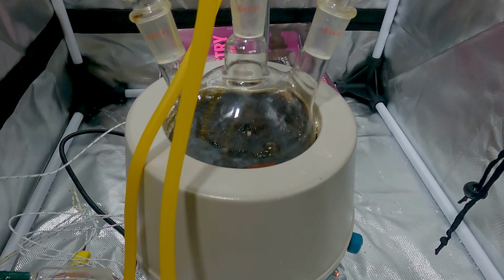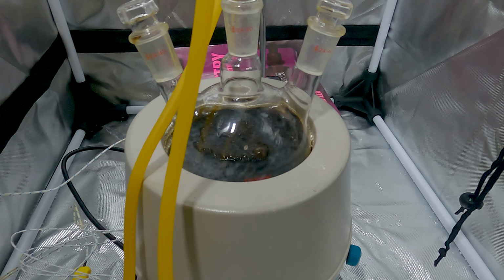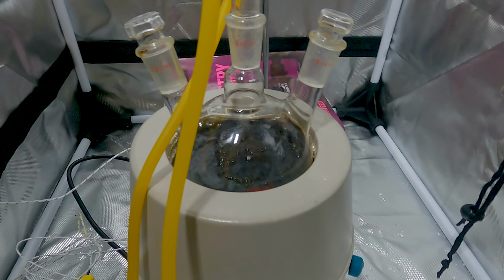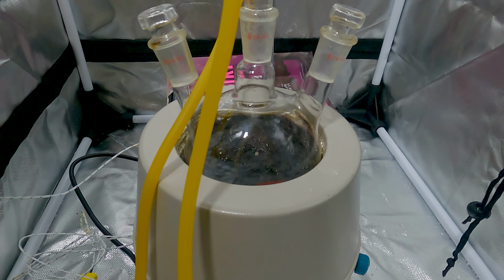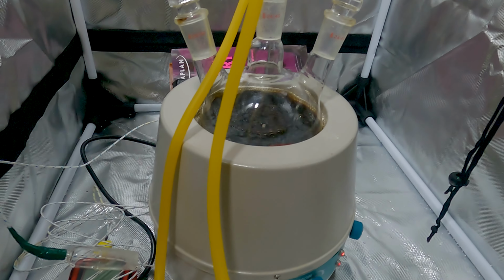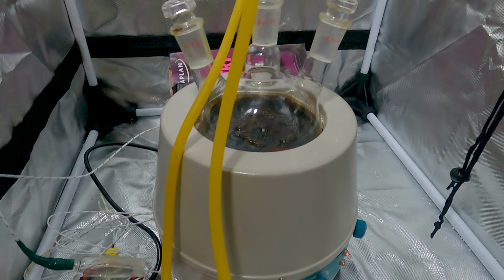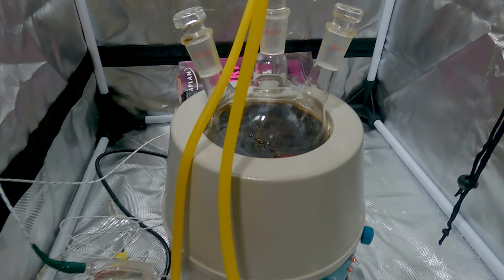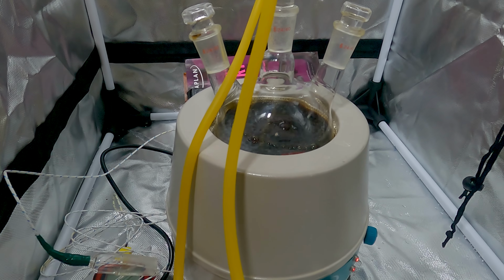If I take the brightest flashlight that I own, which is extremely bright, and shine it directly in here and look really carefully, there's a hint of brown in there. So that's our hint of hope. But the good news is we won't even find out if this worked for another 18 hours. So that'll be fun.